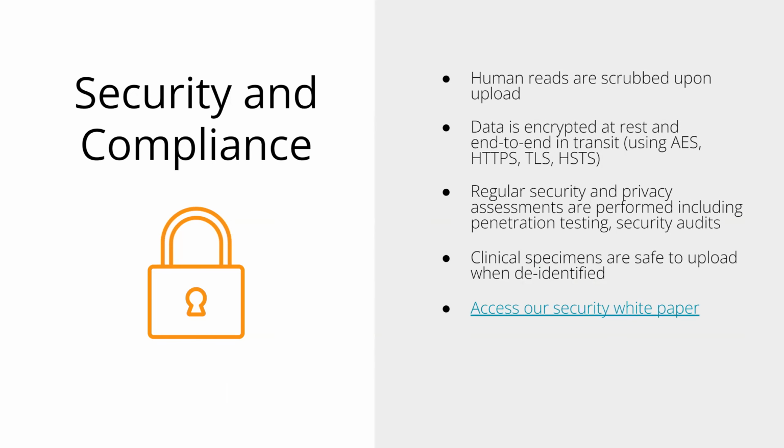I want to talk a little bit about security and compliance. So as I've stated, human reads are scrubbed upon upload. The data is encrypted at rest and end-to-end in transit. There are regular security and privacy assessments, including penetration testing and security audits. And clinical specimens are safe to upload when they are de-identified. So when you upload your metadata, make sure that everything is de-identified. So we do not allow any PII to be uploaded onto CZID.